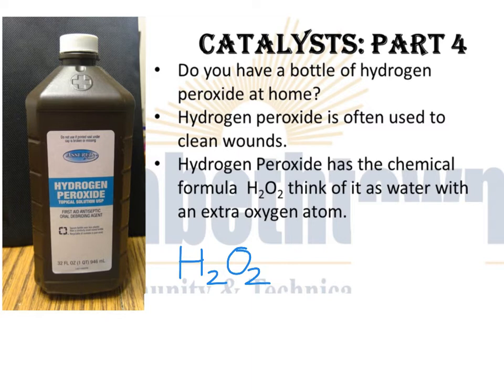Now, the hydrogen peroxide that you use for cleaning wounds at home is a paltry 3% concentration, or less. Probably less, because it was 3% when it leaves the factory. And as we'll talk about, hydrogen peroxide decomposes, for lack of a better term, very, very rapidly.